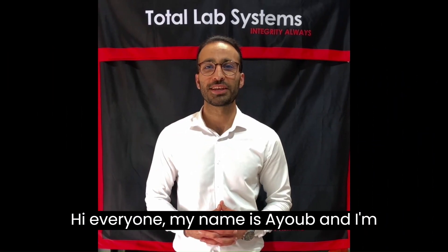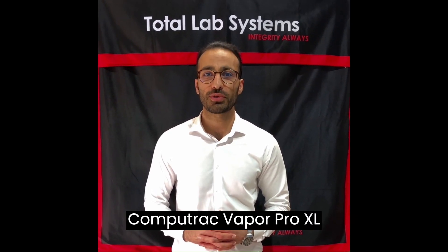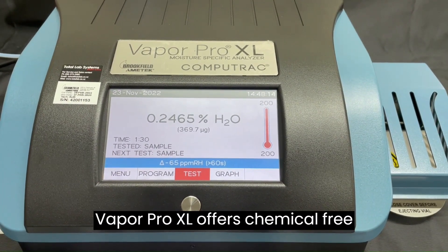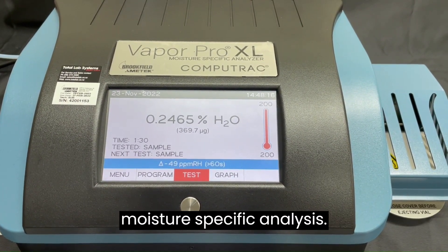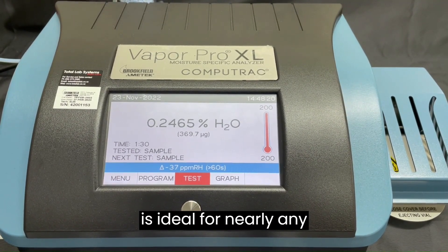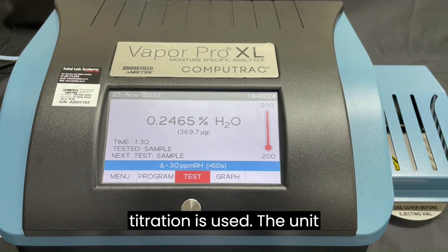Hi everyone, my name is Ayoub and I'm going to talk about the Amtec Brookfield CompuTrack Vapor Pro XL. The Vapor Pro XL offers chemical-free, moisture-specific analysis, and is ideal for nearly any application in which Karl Fischer titration is used.